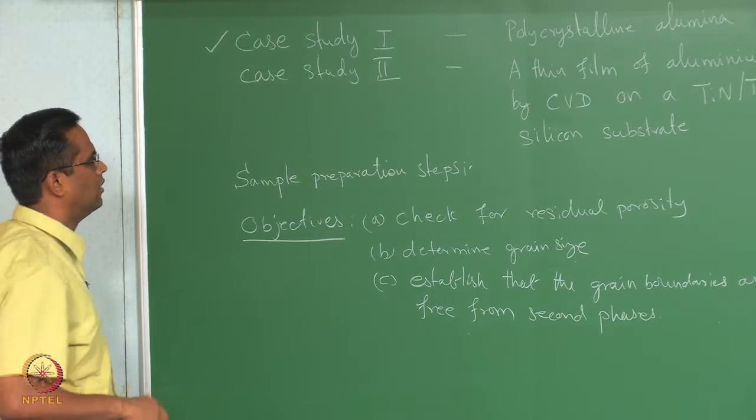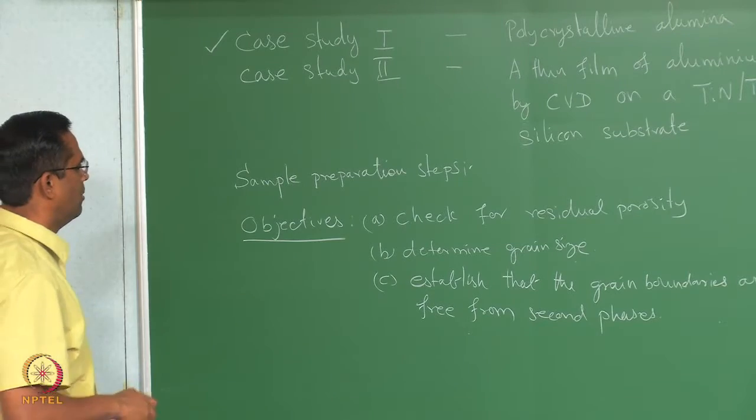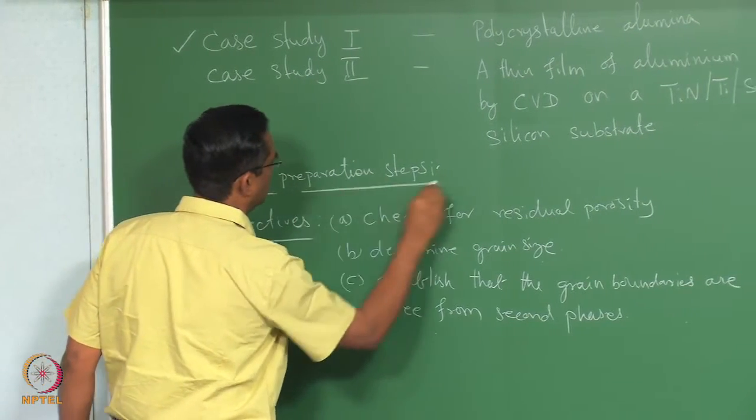Now look at the sample preparation steps, how to prepare the sample.